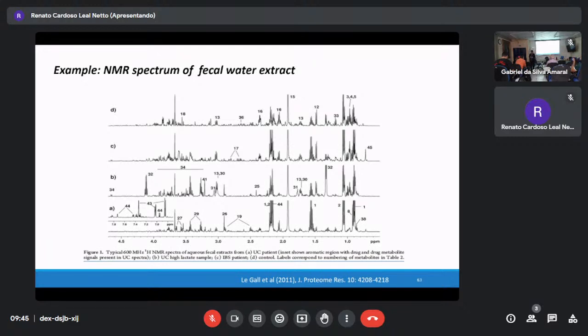One more. If you have a moth, do you know moth? It's like a butterfly. Then there is a powder on the surface. You're interested in the powder. Now it's a powder, there must be different compounds, right? Do you have any suggested sample preparation step?